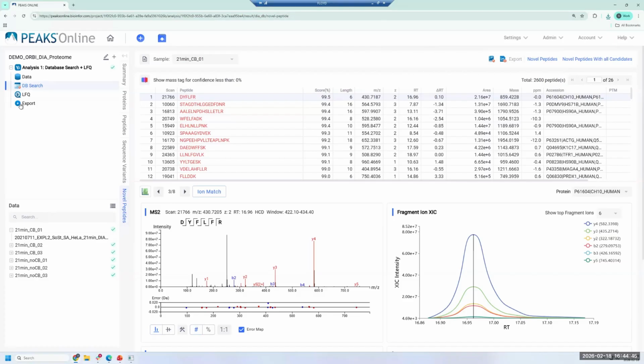So with that, I hope I was able to show you what Peaks Online can do, and I will be happy to take any questions.